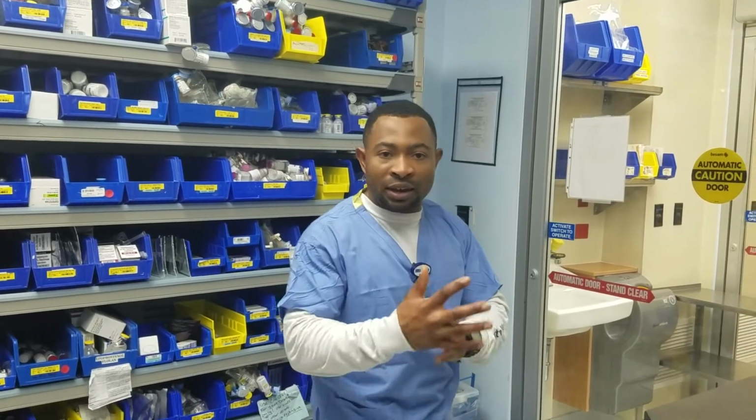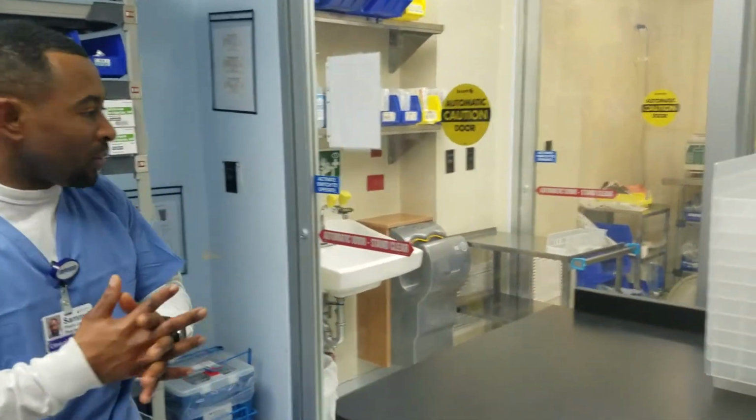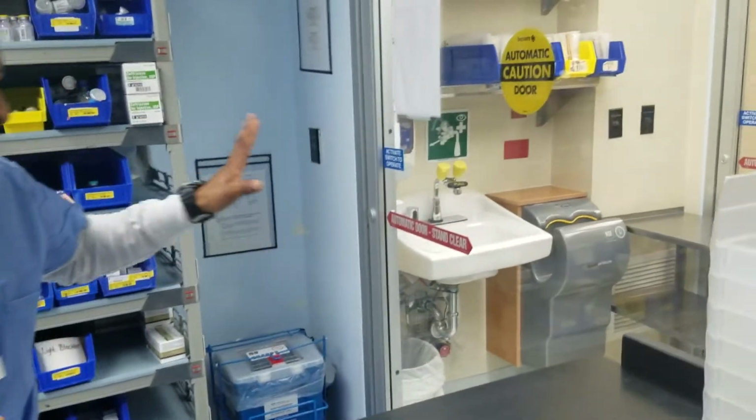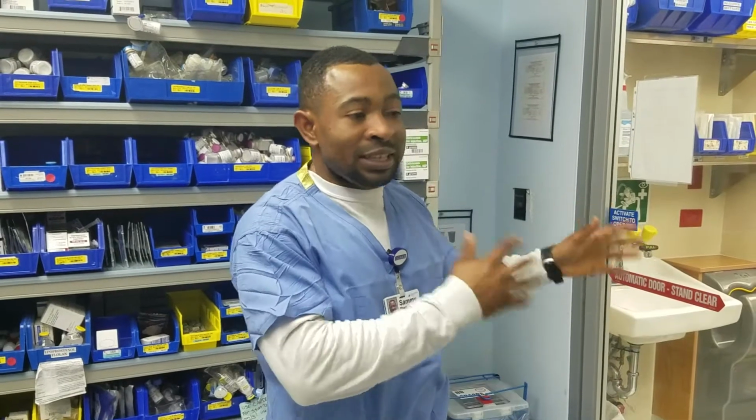They have to be sure that they're all gowned. We have a wash station. They know hands are clean. There's less touching of things around here, just to ensure that everything is maintaining sterility as much as we can, using all the aseptic techniques that we can to make sure that things are well prepared, because these are products that we are preparing for patients and they're all going intravenously, so we have to be sure that they're all made in the best sterile atmosphere.